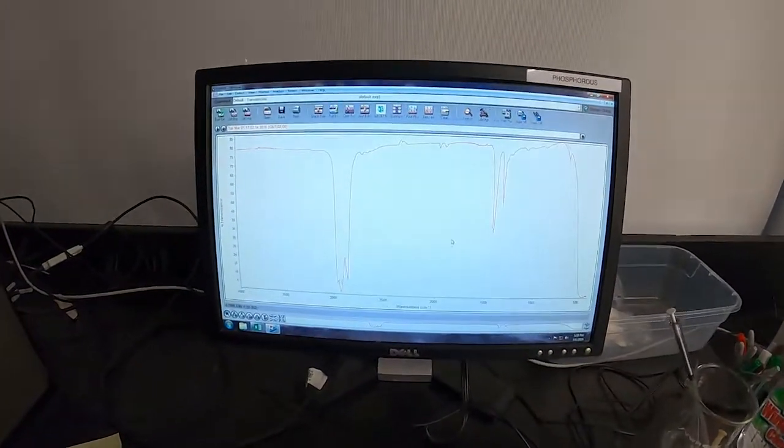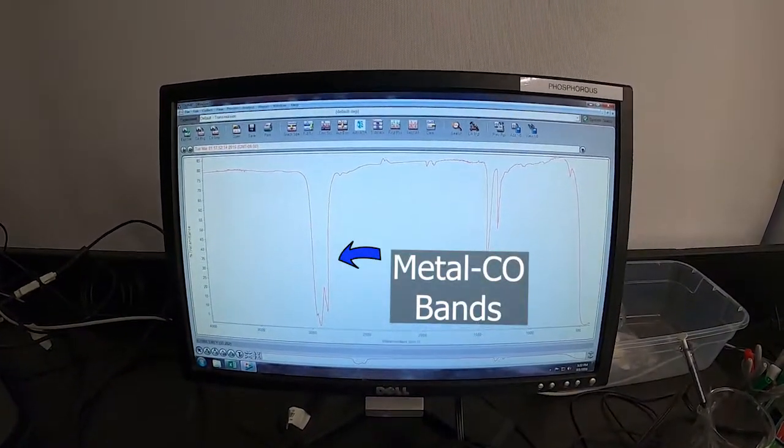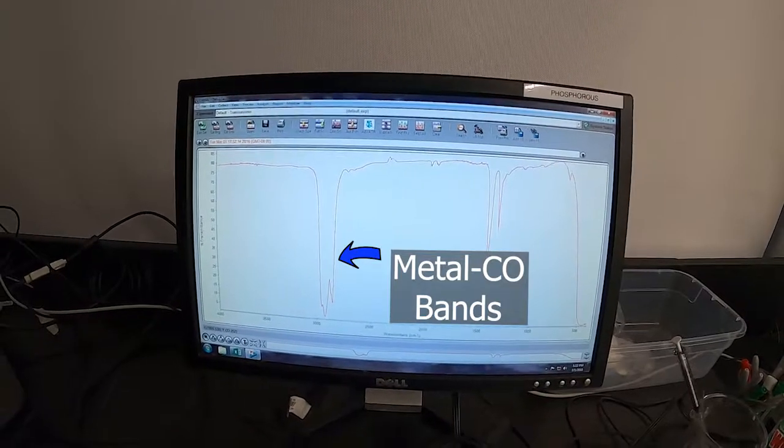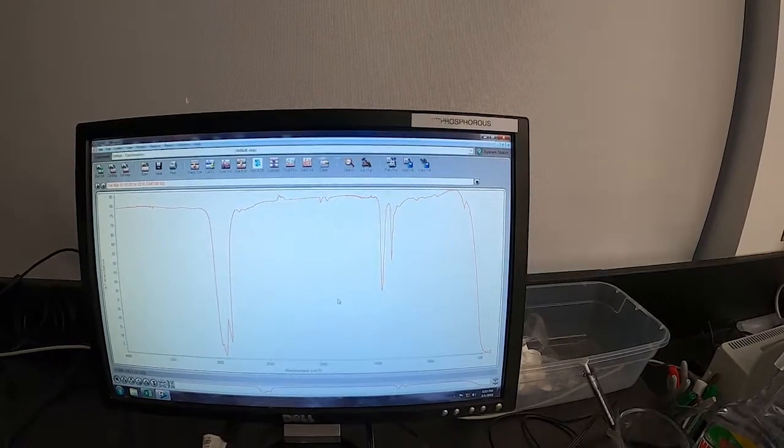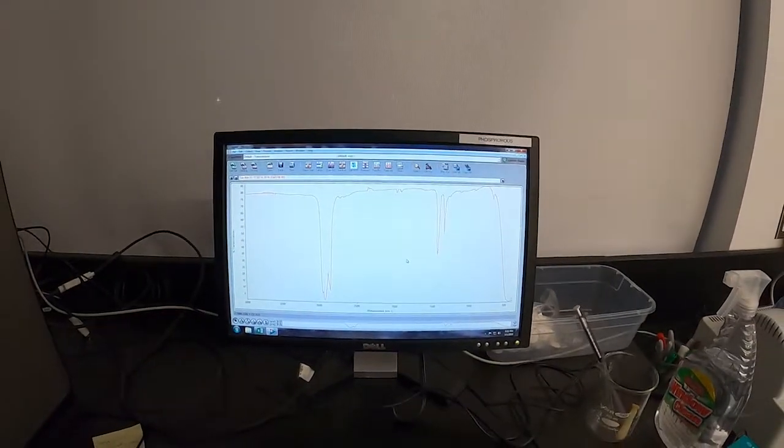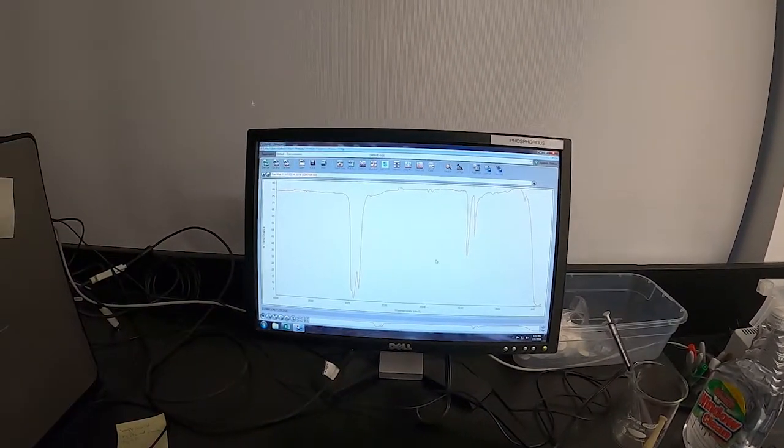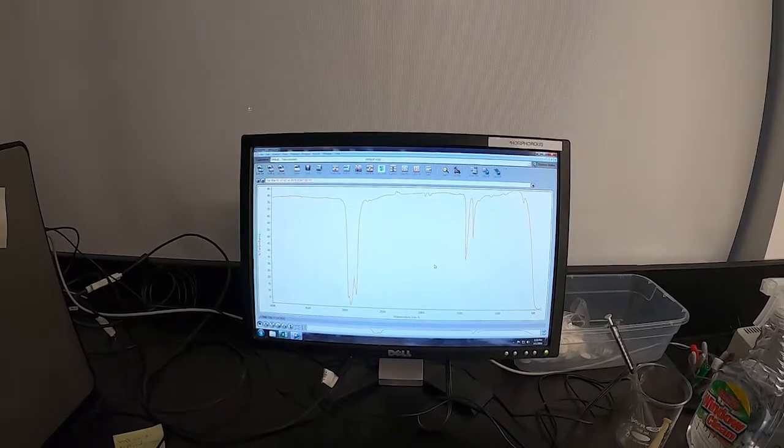And here's our final spectrum. Had to fiddle with the settings a little bit. See our carbonyl peaks there. Anyway, there's the sample prep for Nujol.